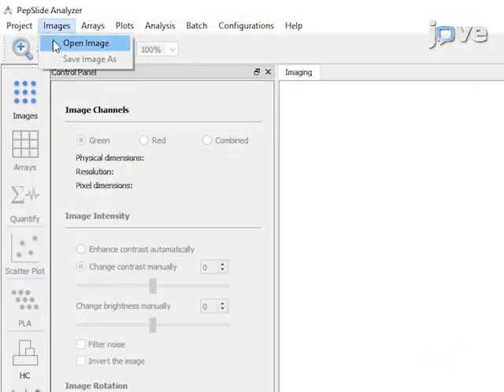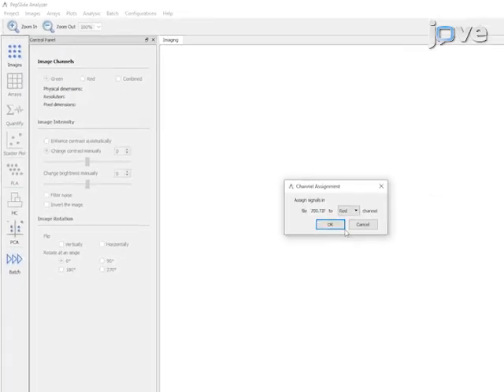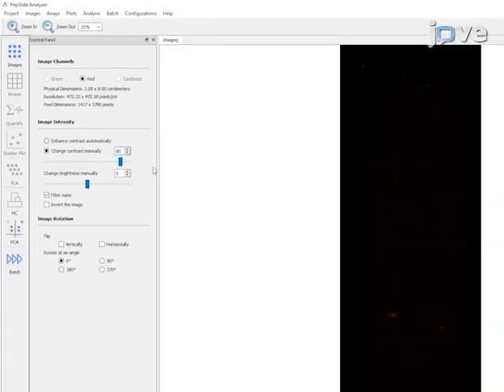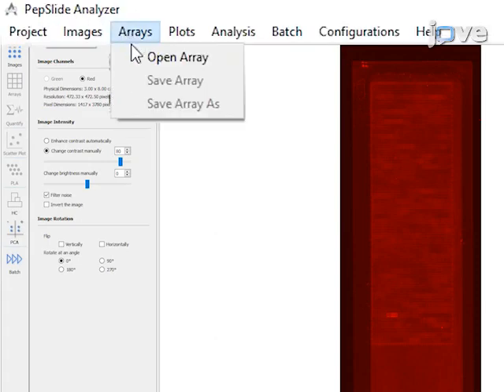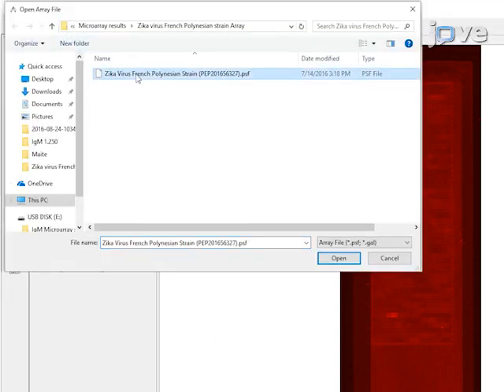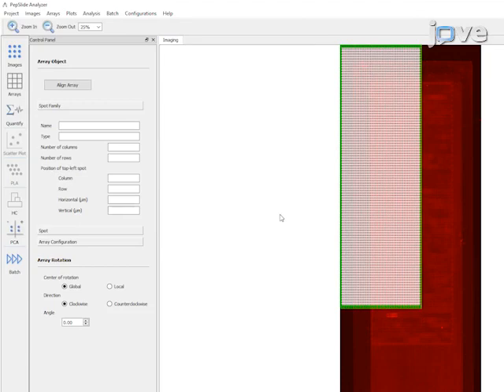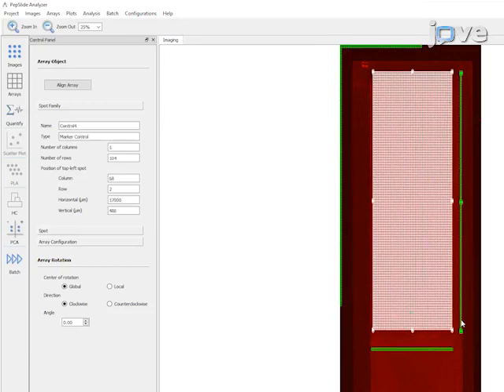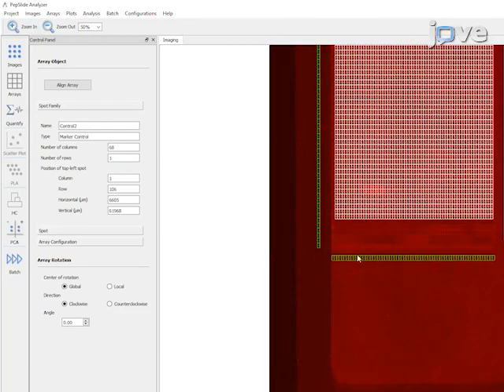To analyze the data, open the raw image. Then open the array grid file. Align the array grid to the scan image with the computer's mouse or keyboard arrow keys.